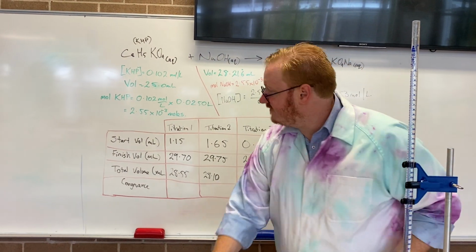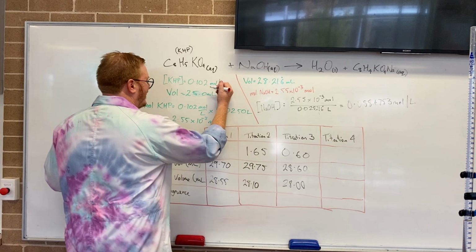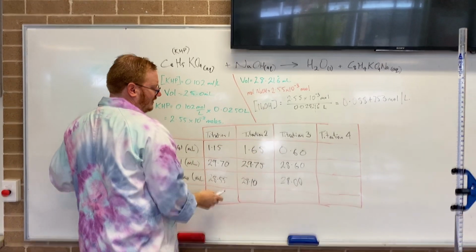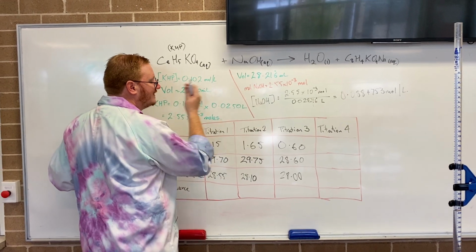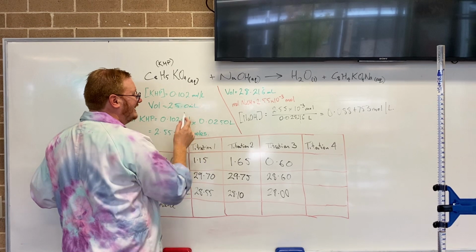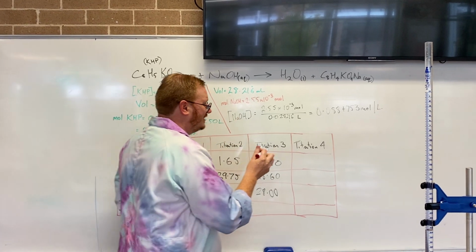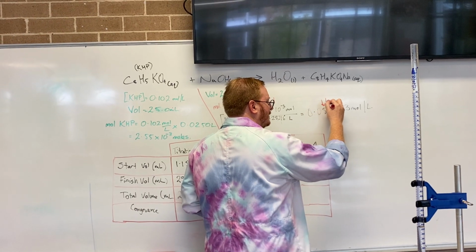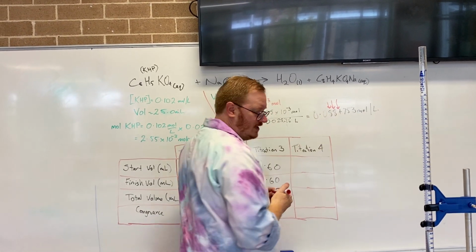Let's check our significant figures. 3, 3. Well, we can only report that to 3 anyway. Or we can report that to 4 actually. So we're limited by the least number, which is 3. So we can report this to 3 significant figures. Coming in from the left, that's number 1, that's number 2, that's number 3.